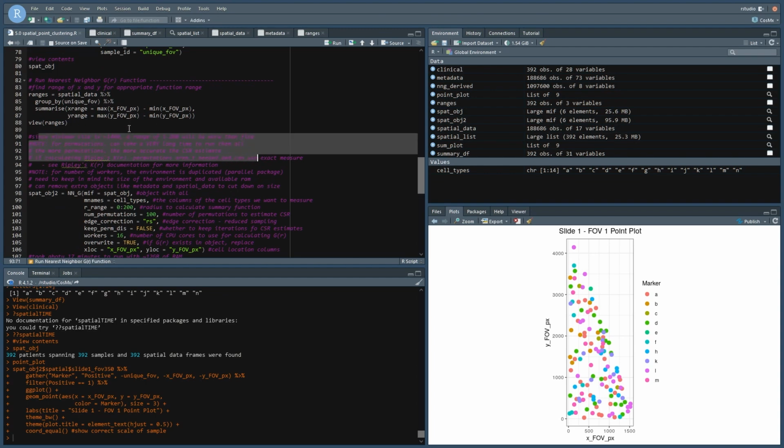So I have some notes here. So I have mentioned this here. We'll have to stay well within our 1400. And we have to remember radius will actually be on both sides of your cell. So R of 250 will kind of put you at an entire circle diameter around a cell of 500.